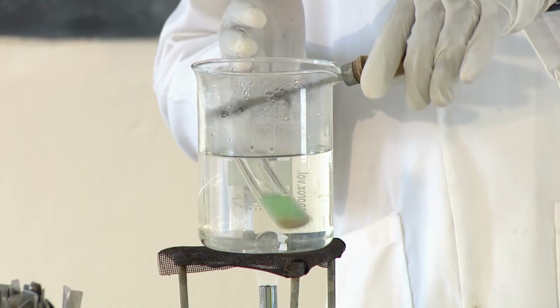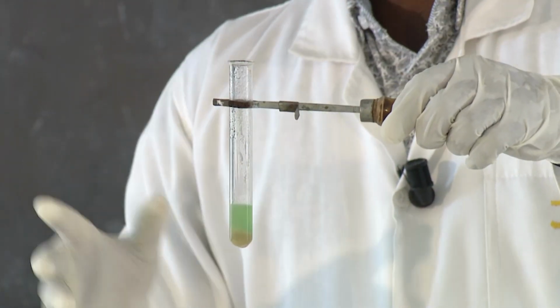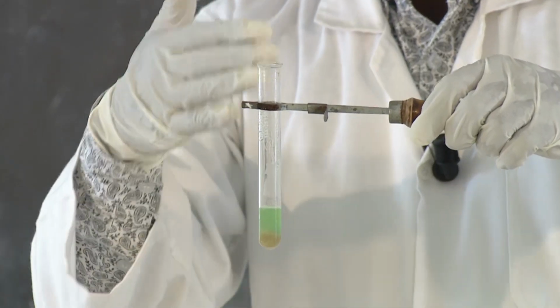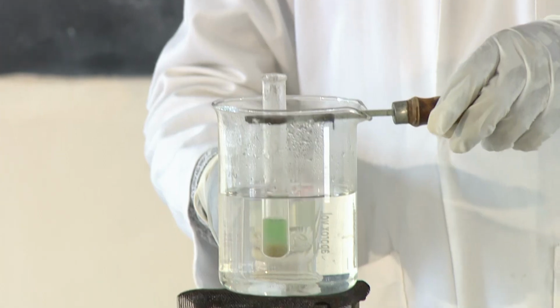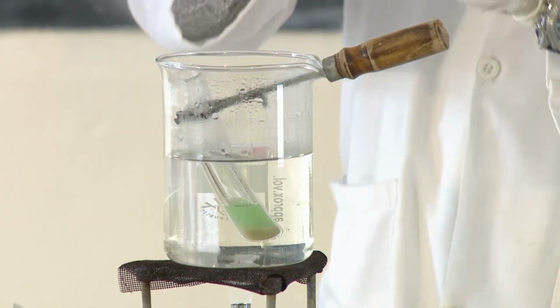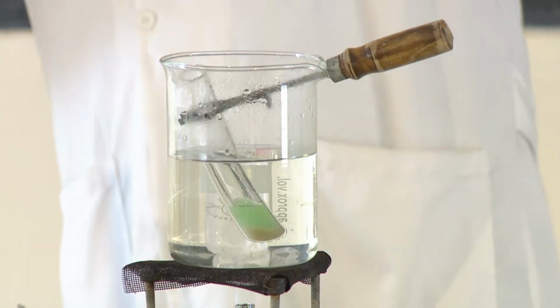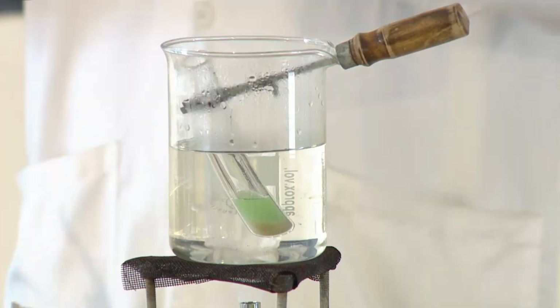So let us try to observe. I think as you see, the color which was blue is trying to change from blue to green. So it is changing from blue to green, then from green to yellow, and finally to moderate orange, or an orange precipitate.